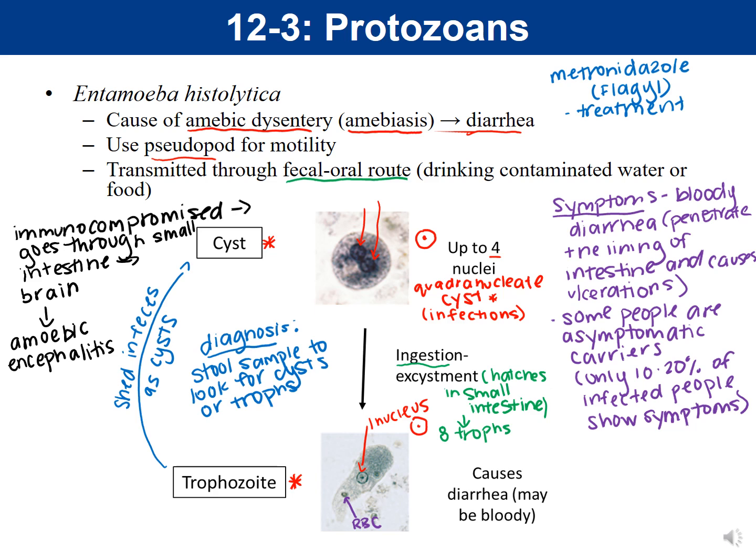And in terms of Entamoeba histolytica, there's one that's related to it that's called Entamoeba coli. And so the reason I wanted to bring that up is because remember when we talked about whenever you talk about an organism for the first time, that it's important that you write out the genus and the species? Well, here's an example of that, right? Entamoeba coli, if you abbreviate that, is also E. coli. So that again illustrates the reason why when you talk about an organism for the first time, you must write out genus and species, and then you can abbreviate it in subsequent times with the genus being abbreviated.